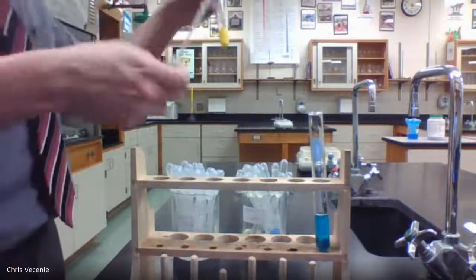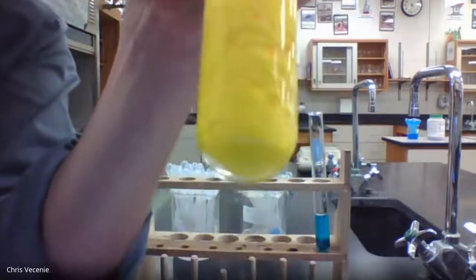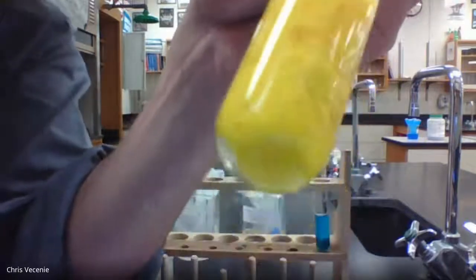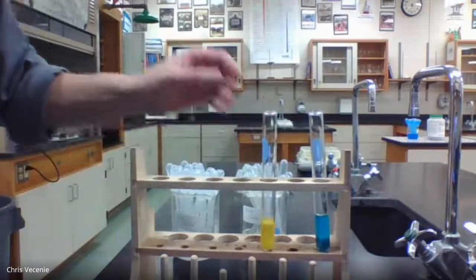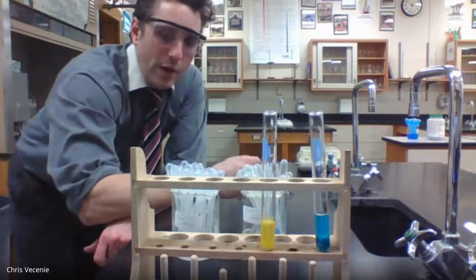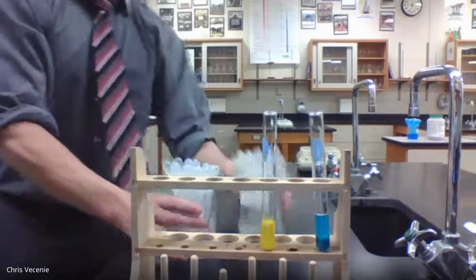I'm going to hold that nice and close so you can see what's going on. If you take a look, what you're seeing here is a yellow solid. You see how it can look all grainy. So I'm going to put that up there. In your observation section for reaction number 2, you're going to want to list that we formed a yellow solid, and there's still a clear colorless liquid in there. So that was reaction 2.